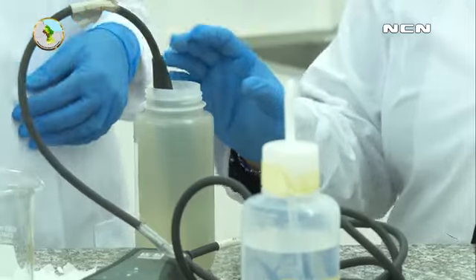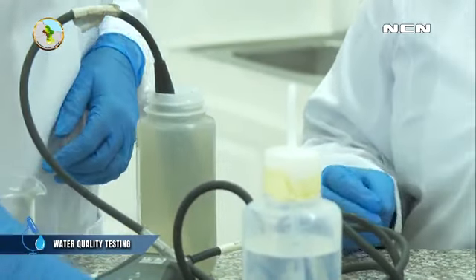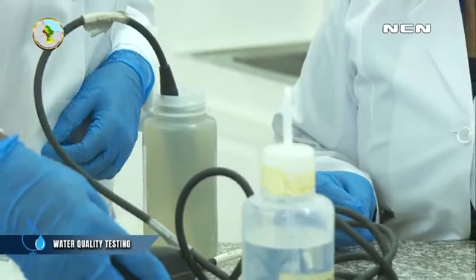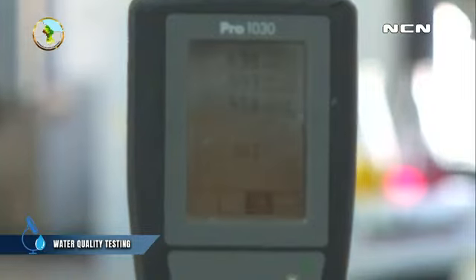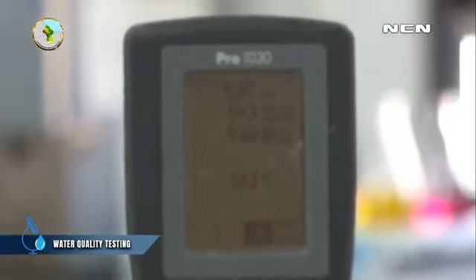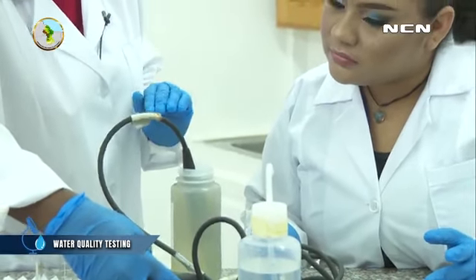And how long does it need to sit in here to get the reading? When you look at the meter, you see the reading, you just have to wait until it stabilizes. It's going to keep fluctuating, and then it's just going to stop and stay at that particular value. So we just have to keep looking at it until the value no longer changes.